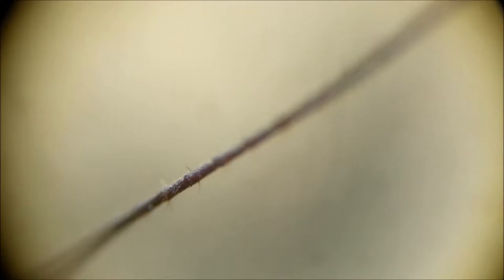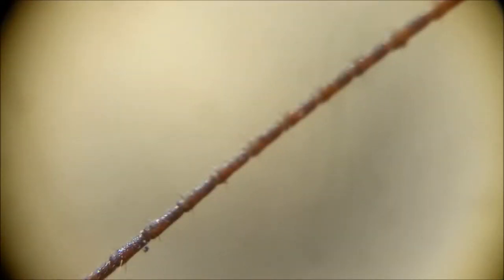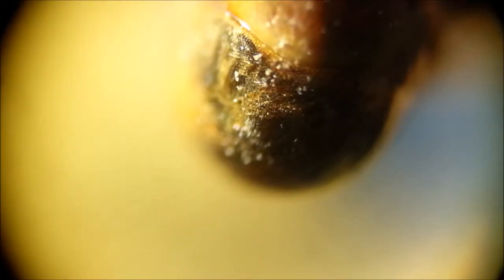Alright, so here I have a praying mantis, and this is the one with the wings folded out, and it's not in the box. So we get to flip it around and take a look at all the interesting features. And right now, it's the antennas. So these are the antennas on the praying mantis. Very long, very delicate. And you can see there's little hairs that are sticking out, four of them per segment. And let's get back to the head. Take a look at that in more detail.